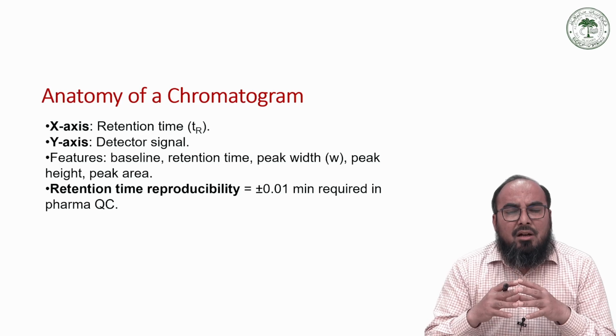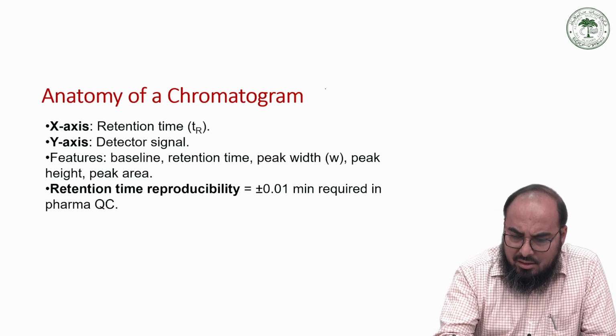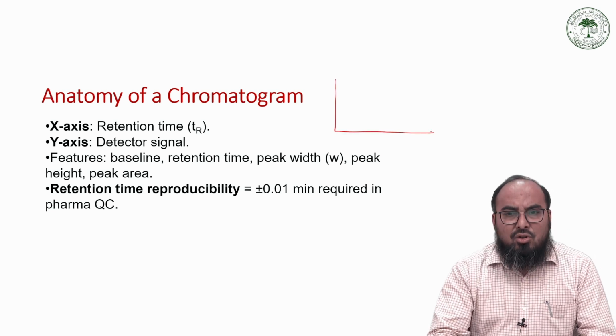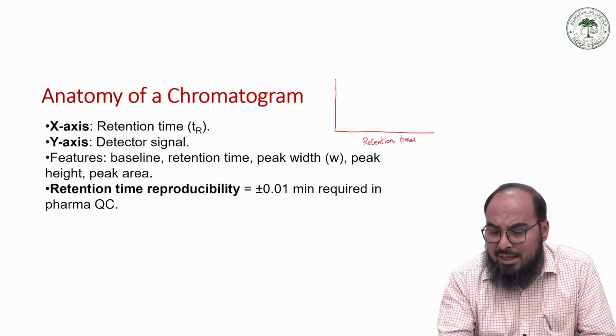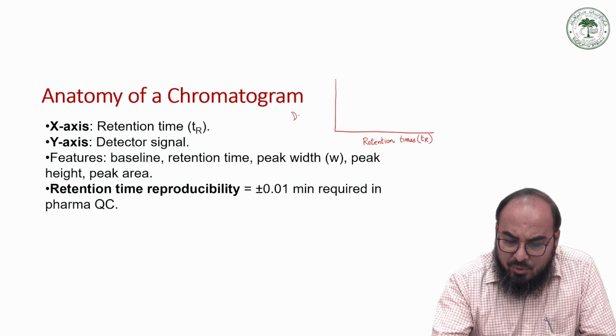Similarly, what actually is a chromatogram? It is a pictorial representation. On the x-axis you always have retention time, which you represent by TR. Similarly, the detector response is always on the y-axis.